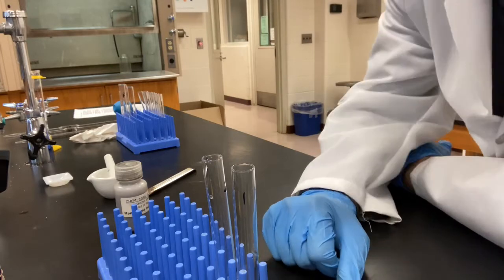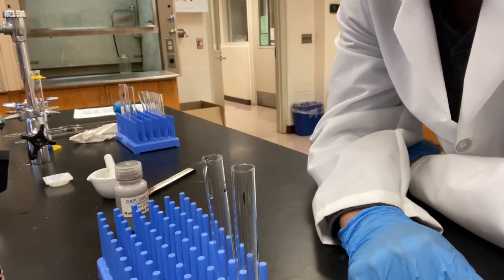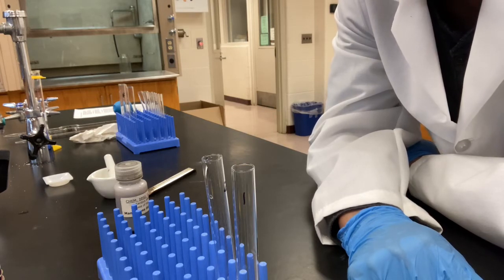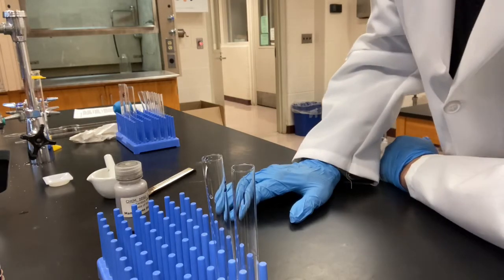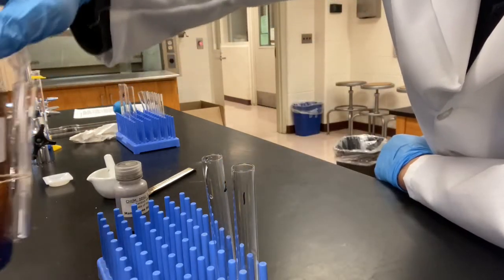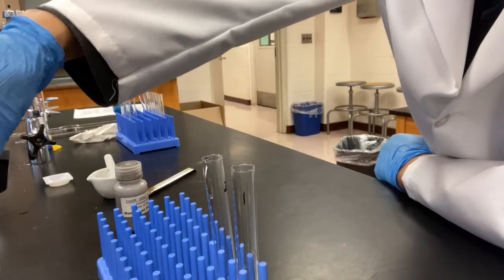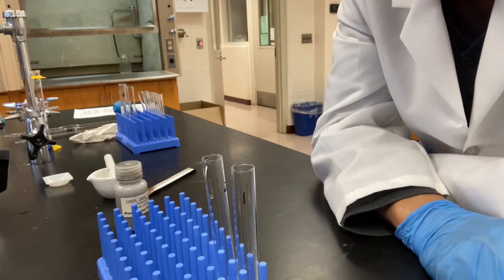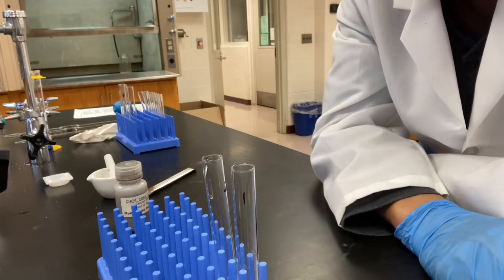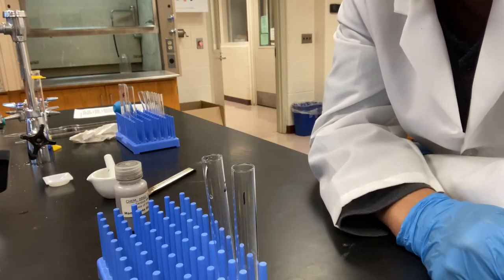All right. Now, the last part of this lab, the impact of a catalyst on the reaction rate. The reaction we used is the decomposition of hydrogen peroxide. This is hydrogen peroxide. Hydrogen peroxide is not stable. It will decompose to produce water and oxygen. When oxygen is produced in the liquid, you see bubbles coming out.